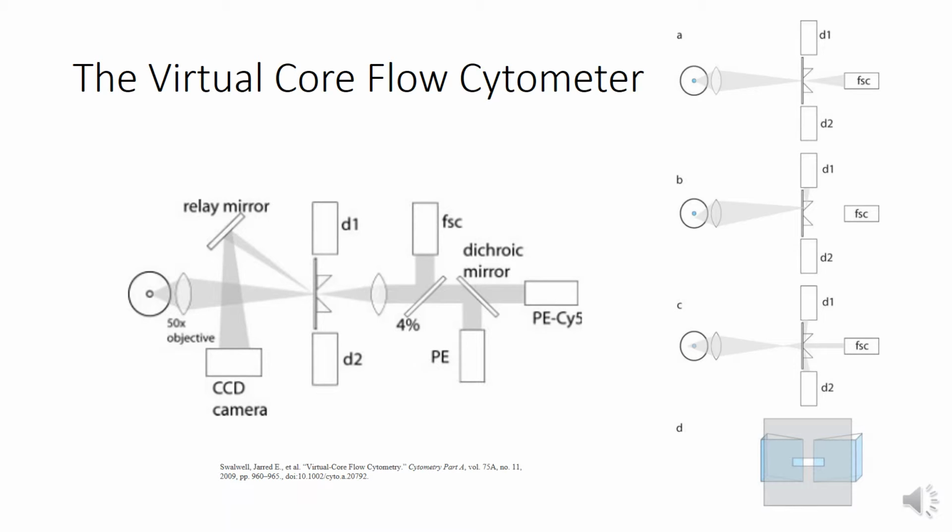Showing some characteristics from confocal microscopy and quoting the paper, the system is based on the principle that light from a properly focused object will pass through a pinhole located in the image plane, whereas improperly focused images will cast light onto multiple detectors located at the edge of the pinhole. This is to ensure that they only receive measurements coming from centered particles so that they can get the best possible measurements.